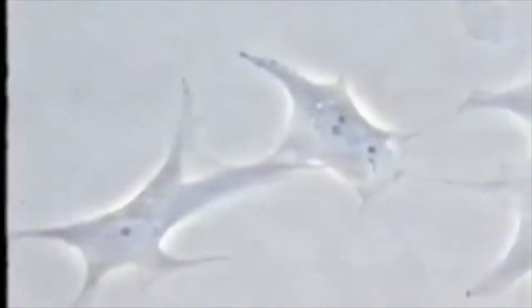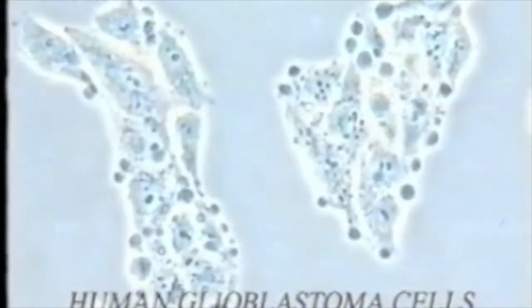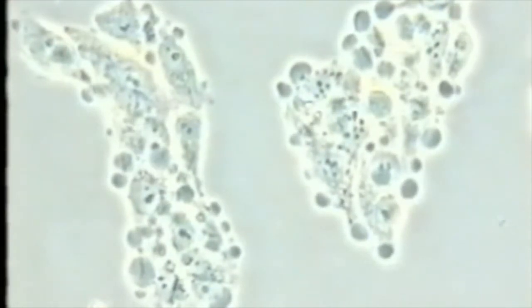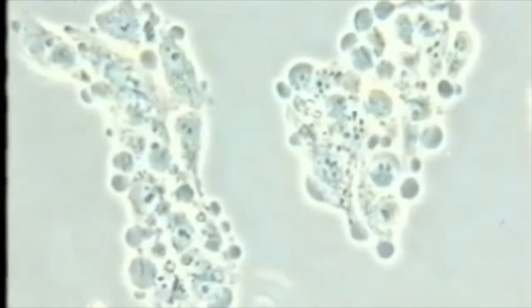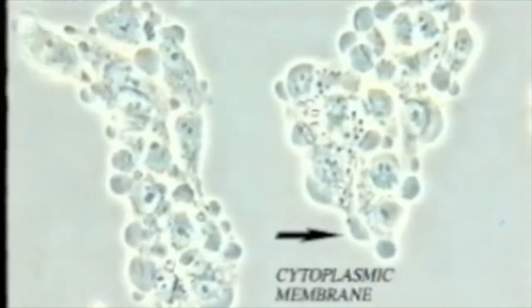In contrast, the path of PB100 may be easily followed because of its yellow color under visible light and blue natural fluorescence under UV. We shall now add PB100 at a concentration of 1 milligram per milliliter to a glioblastoma cell culture. Changes observed using the normal low doses occur more rapidly and become more striking using this very high dose. Morphological changes occur in cells within minutes.